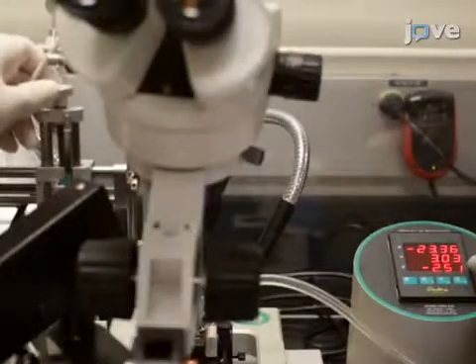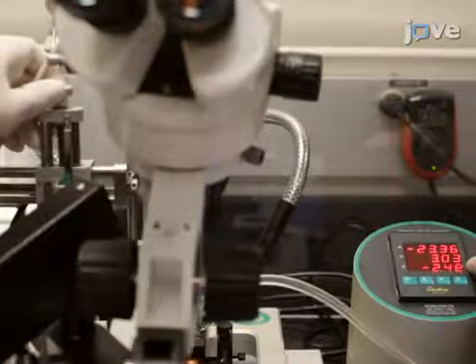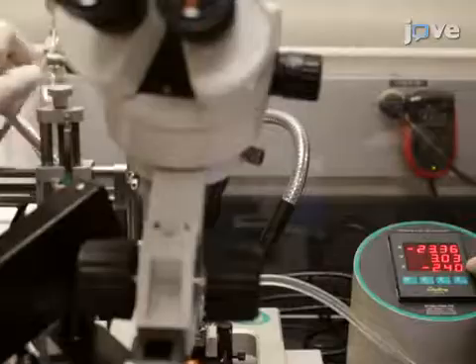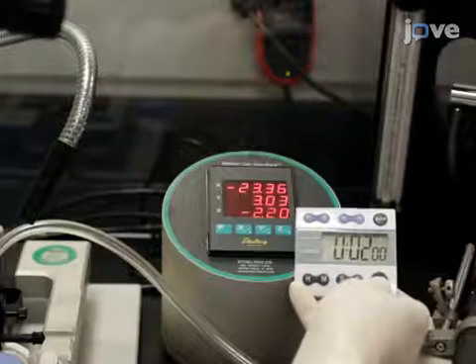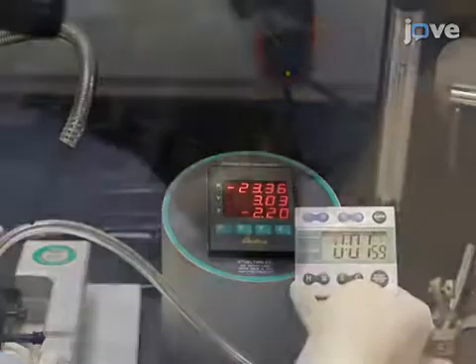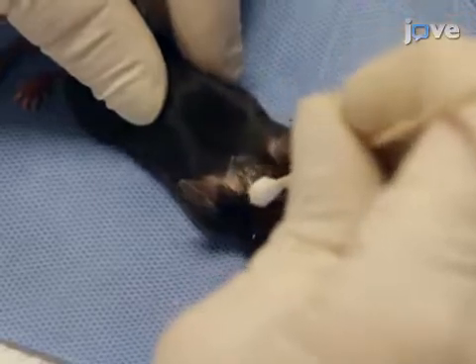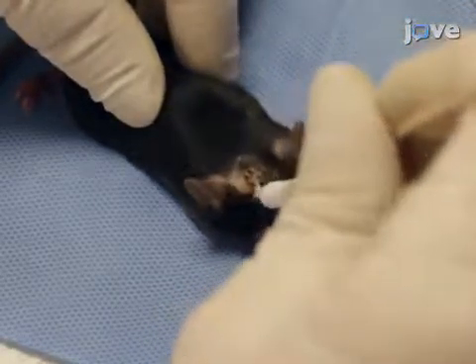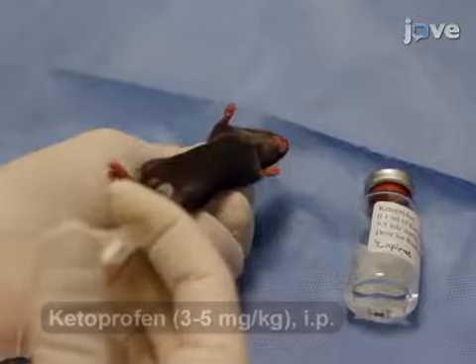Slowly lower the syringe to the deepest z-depth and begin injection at a rate of 0.25 microliters per minute using a stereotactic injector. After the injection is complete at the deepest z-depth, wait one minute before raising it to the next coordinate and begin injection again. Continue this pattern until all the z-injection coordinates are injected. After the last injection, wait two minutes before removing the syringe. Then remove the mouse from the stereotactic instrument and suture the scalp. Apply lidocaine and antibacterial cream to the surgical site and administer pain medication before transferring the animal to a heated recovery chamber.